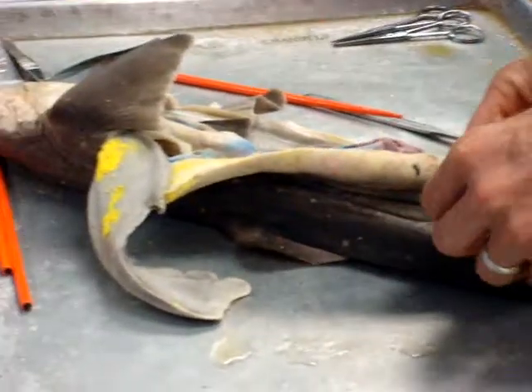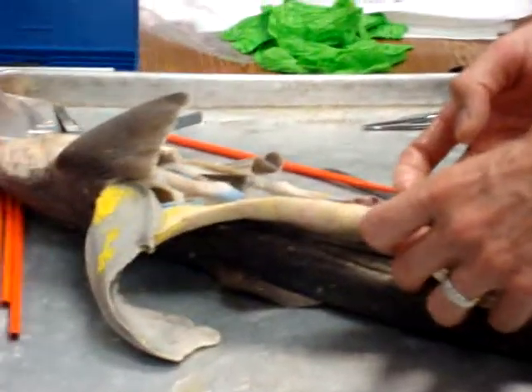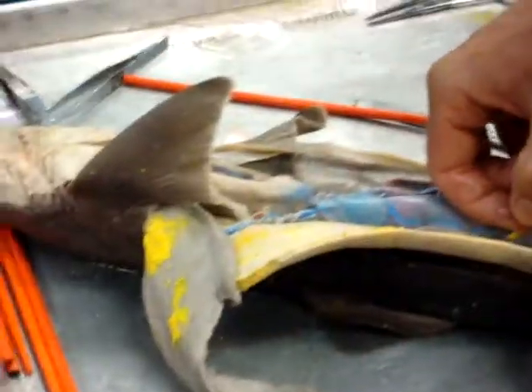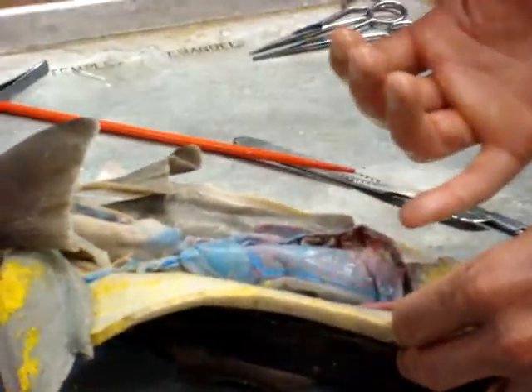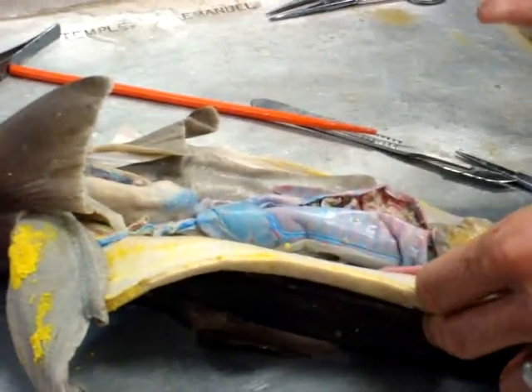The colon is simply the terminus of the small intestine here. The colon will empty into where? The cloaca. Cloaca, good. Okay, rectal gland. Hopefully it's pretty easy to see. Here it is. The rectal gland allows for, what would you call it? Osmoregulation. Okay, so osmoregulation meaning that it's able to regulate the amount of salts in the body.